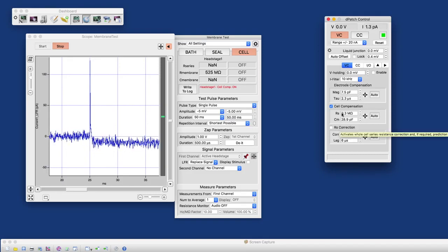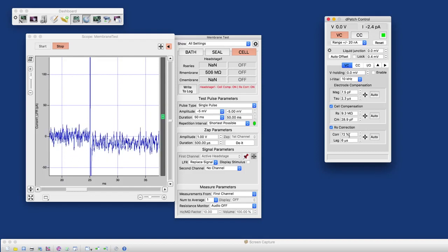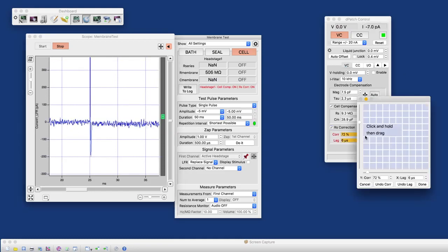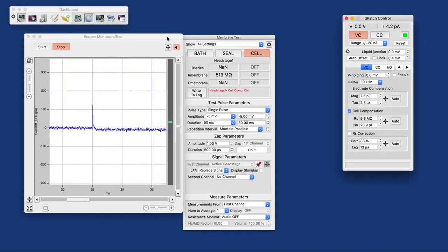correction. Due to the digital architecture of the compensation circuits, we can afford to do relatively much series resistance correction. 70 up to 90% should be feasible. But as I said, I'm not going to spend too much time here on trying to optimize that. But we'll just leave it as is and move on to routine data acquisition.